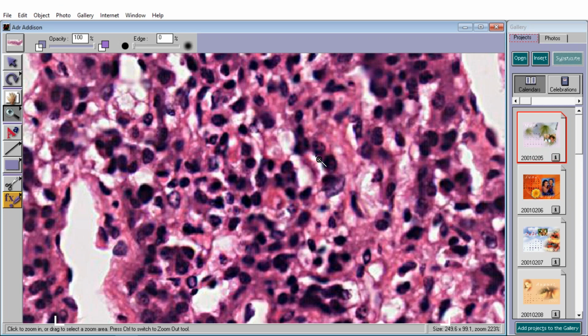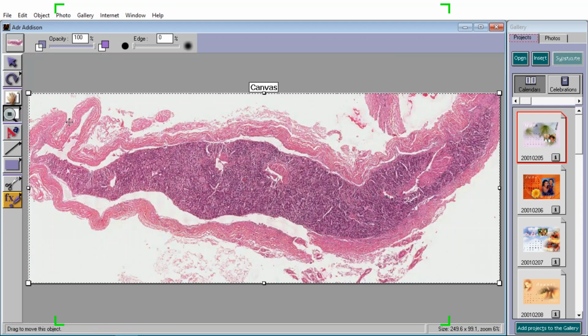Okay, well, we could call it all those names technically, but the name that most people still call it is Addison's disease. Okay, this is a precise definition of Addison's disease is autoimmune adrenalitis. And remember, we said that with most of the autoimmune inflammatory diseases, it's a chronic inflammatory infiltrate. That's why most of these cells are lymphocytes. How do you like that? So in this case, not only is it attacking the adrenal cortex, but it is making the amount of viable cells of the adrenal cortex greatly reduced in number. So, do you think that clinically this patient might have suffered from a chronic lack of adrenal cortical hormones?